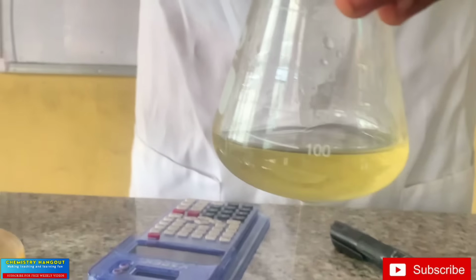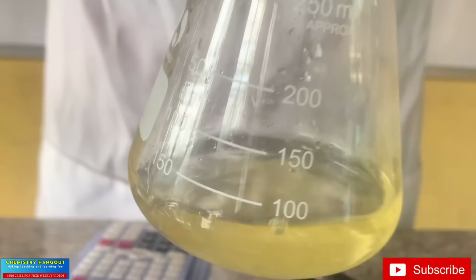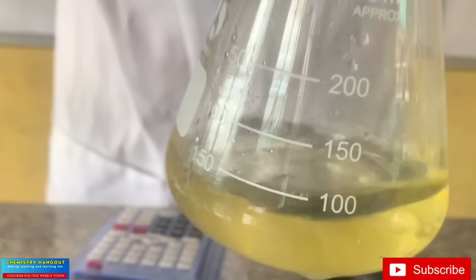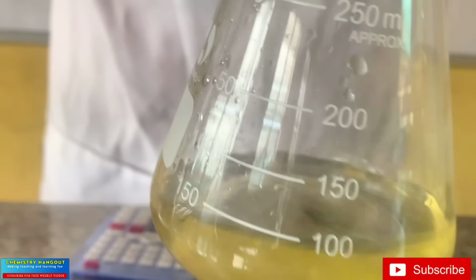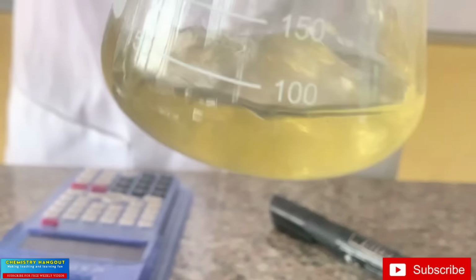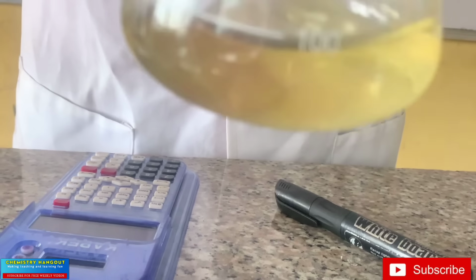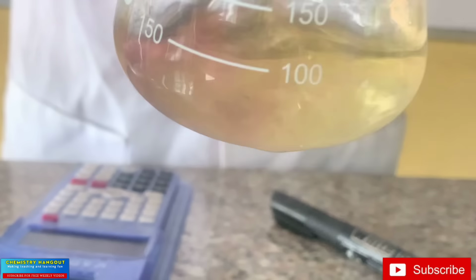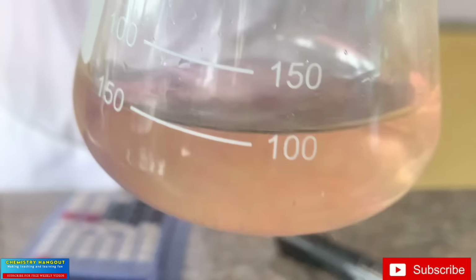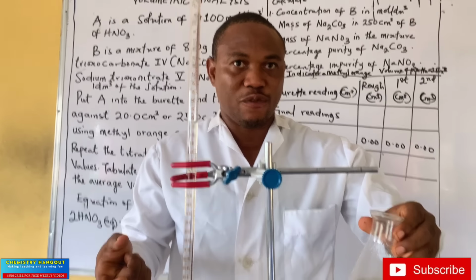So gently, just watch. Still going. You see that now? This is already changing. Let's add a bit. Good. Did you see that now? Did you see the color? So this is the color change now. You can see it from the color we started with before to this now.